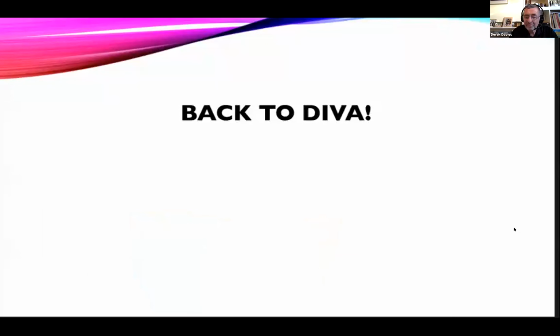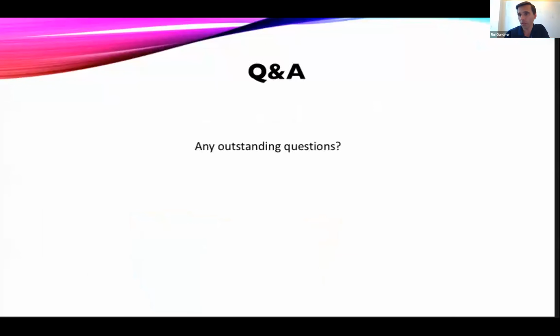Go ahead, Roy. You know, there were a few questions here on autofluorescence. So why, Kathy, why did you choose the BV421 as an autofluorescent channel? I was explaining, so I was typing the answers here that, yes, we could have used FITC. We could have used anything from blue, green, and orange as autofluorescent channels.